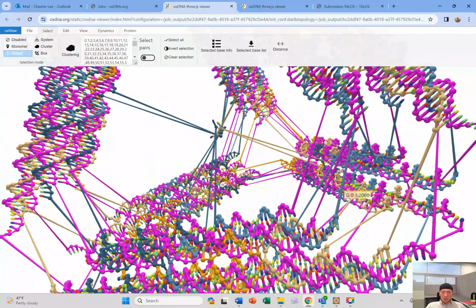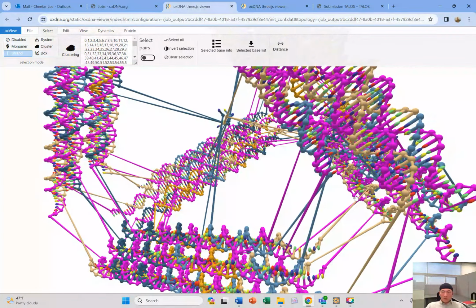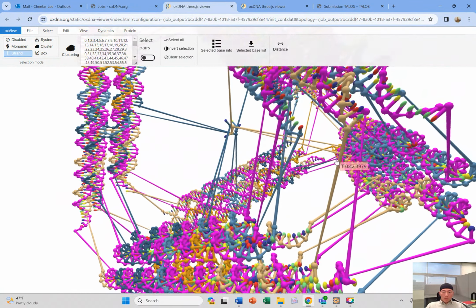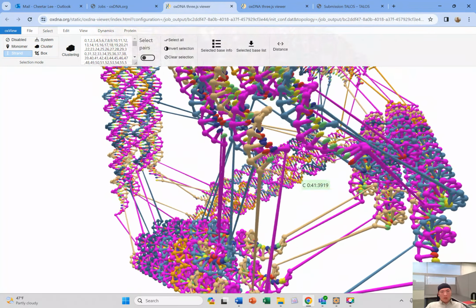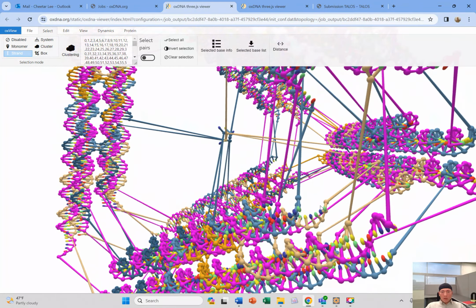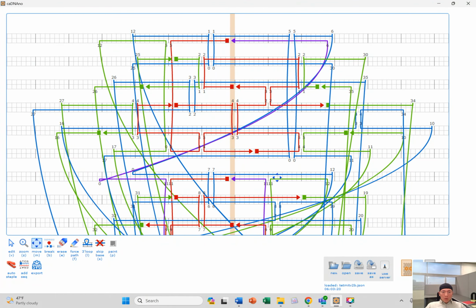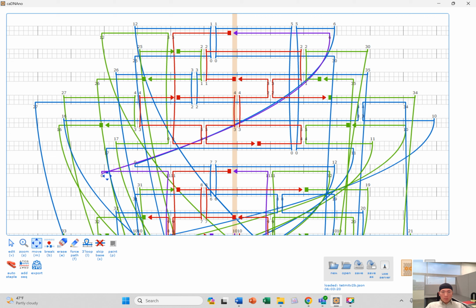Because single-stranded DNA is quite flexible compared to double-stranded DNA, and even more rigid is an entire bundle. Anyway, so that's why there are these extra base pairs that are unpaired on the path panel, as you can see here. Even the scaffold has an extra base that is not paired right here, which is interesting to know.